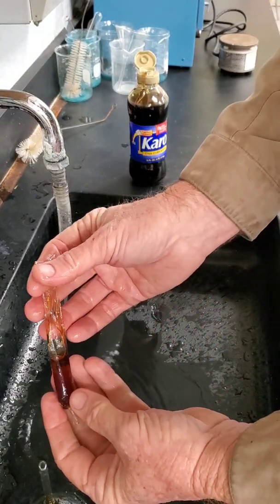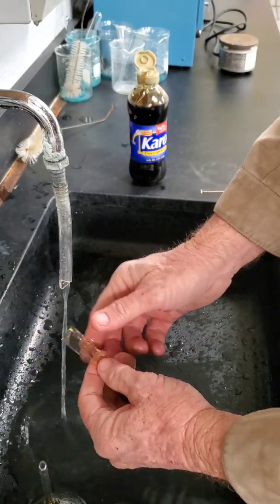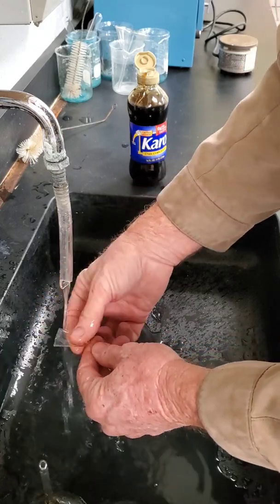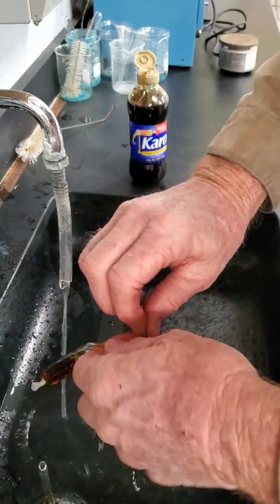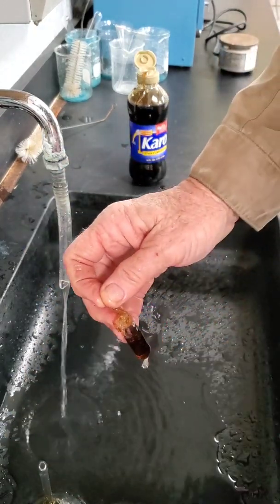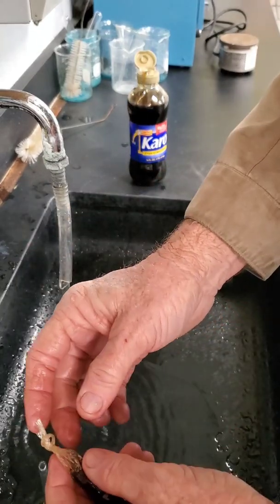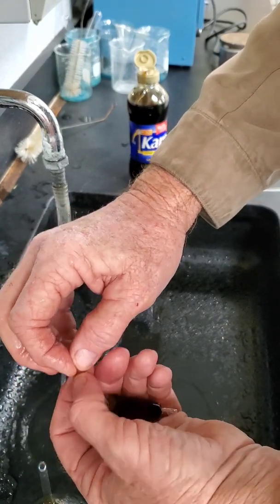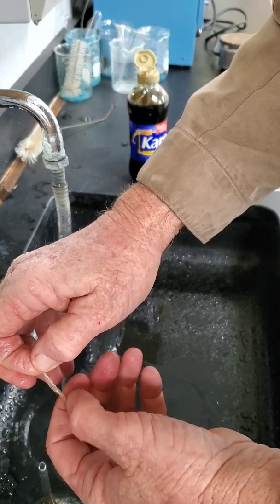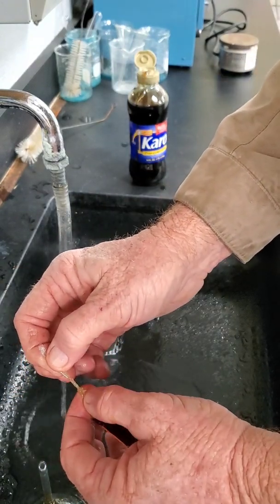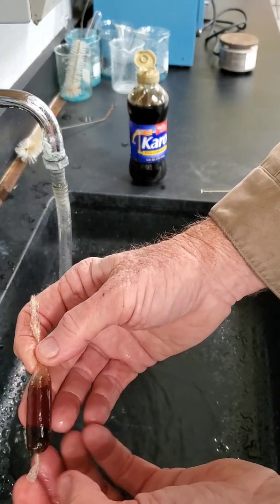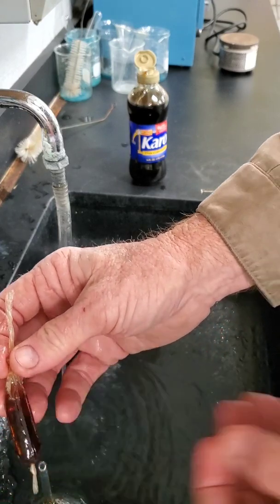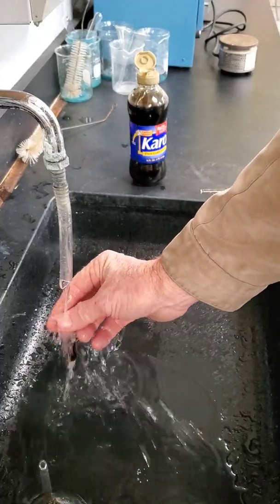Now we're going to rinse it off. We're not going to let water get inside the tube, we're going to rinse off the outside. Then we're going to tie this end in a knot. We have the knot and we're going to slide that knot down as close to the syrup as we can get it, so our little syrup hot dog that we've made. I'm going to pull it tight. So we have a little bag sealed on both ends, so nothing can get out.